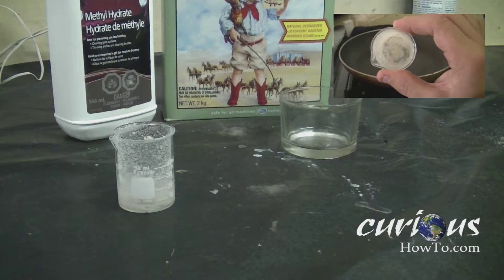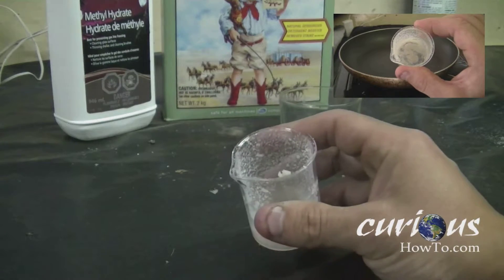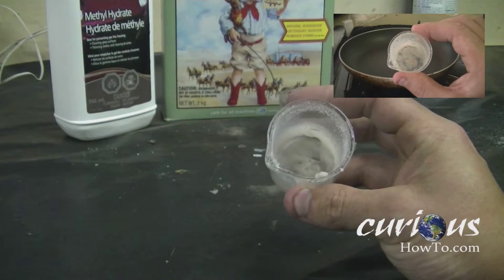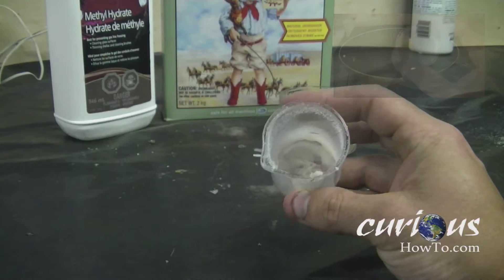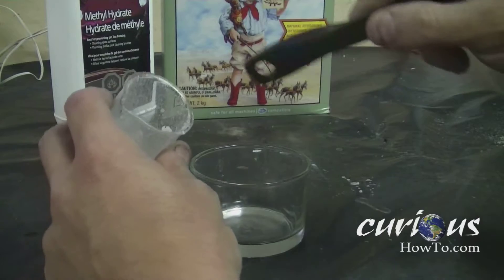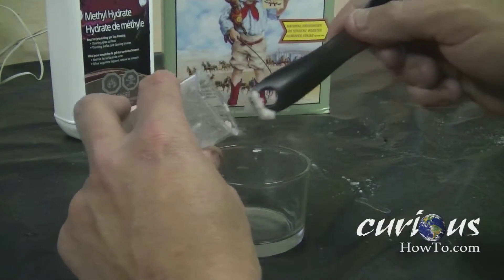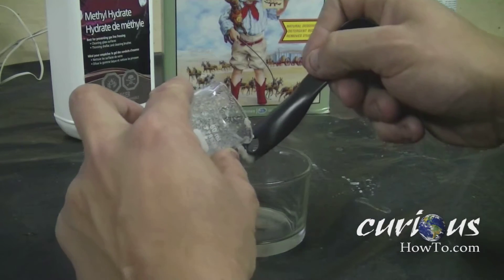For this project we're only going to need a few things: a vase, some methanol, and some boric acid, which we made in another video. First thing you're going to want to do is scrape some of the boric acid that you made into a container. Make sure that this container can handle some heat — a glass container would probably be best.